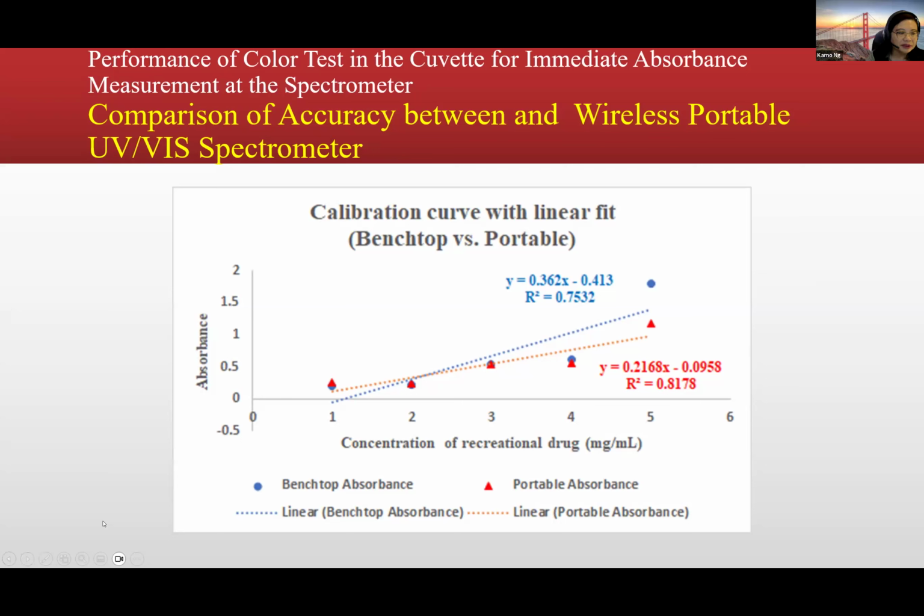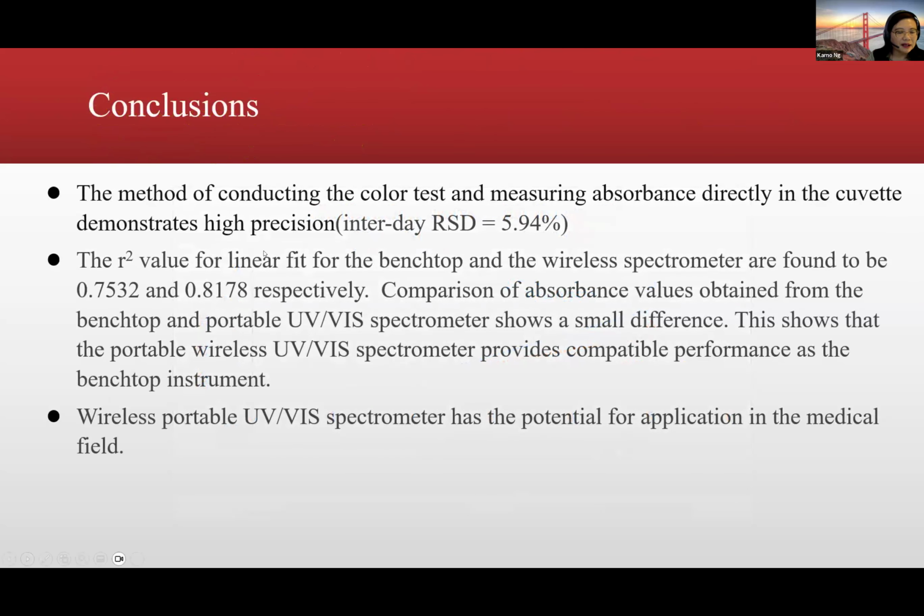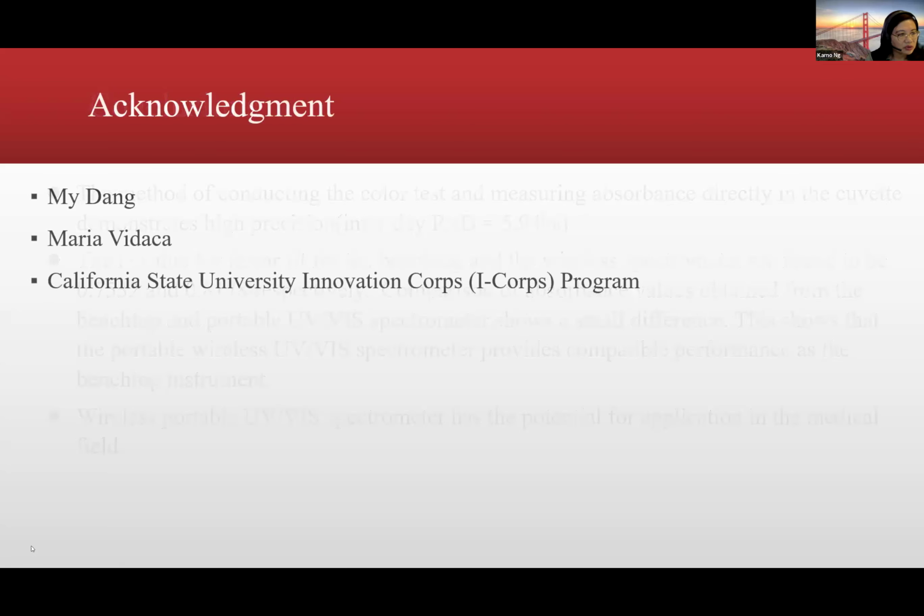So this preliminary data shows that it is possible to carry out this color test inside the cuvette and detect the absorbance directly and immediately with the wireless spectrometer.